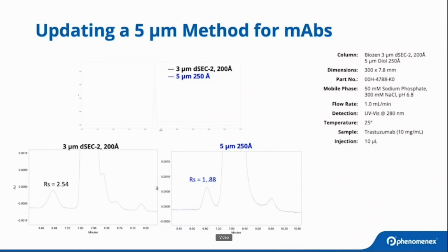However, when you transition to a new size exclusion platform, the intent is to move towards a more reliable solution and not necessarily one that's providing additional information. If you've got historical data only suggesting there is one fragment and you now see data with 2 different post-peak fragments, this is going to be a cause for concern.